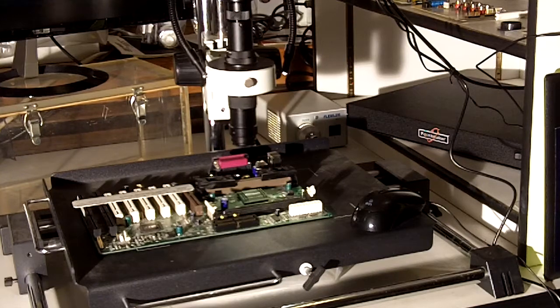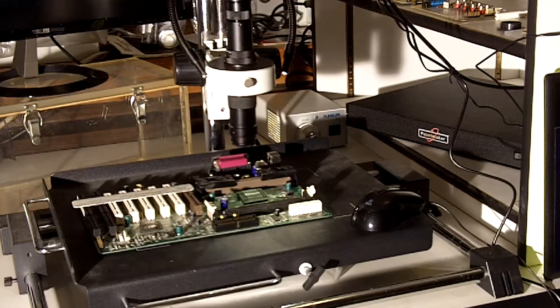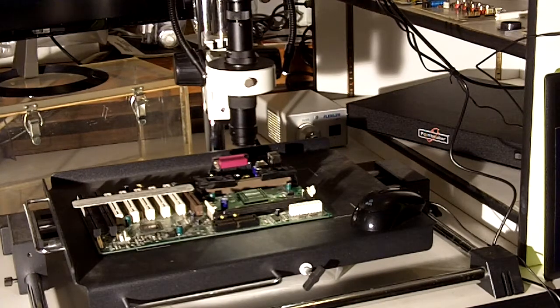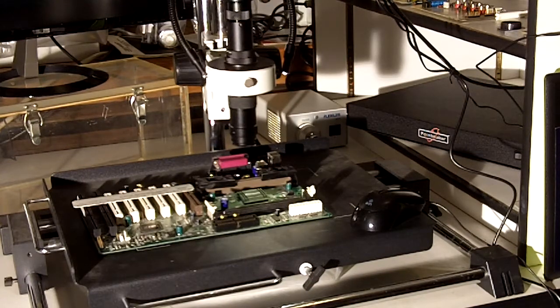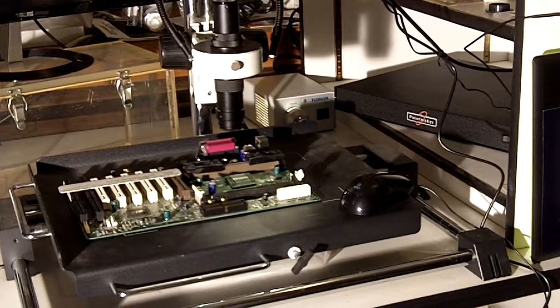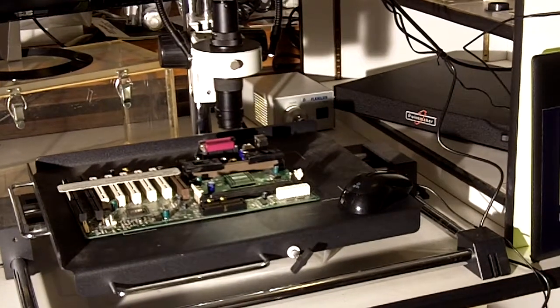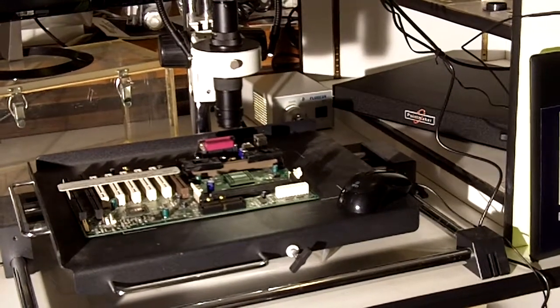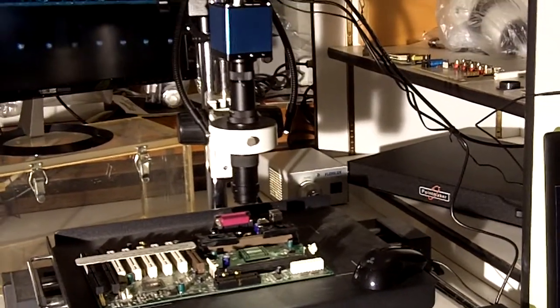Again for large objects such as large circuit boards, works of art, anything that's large that you want to move very precisely can be used with this system.